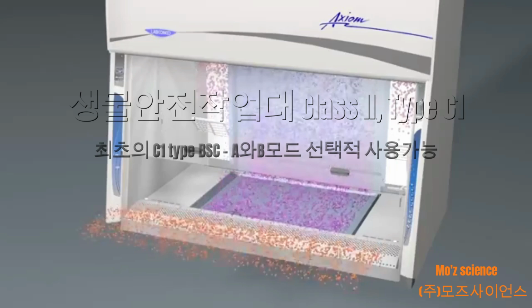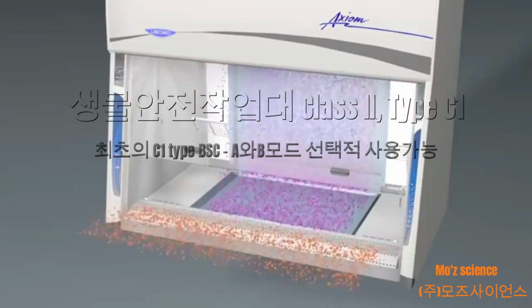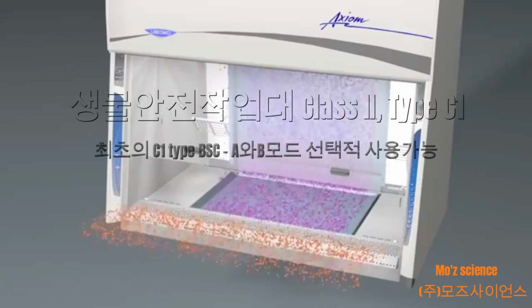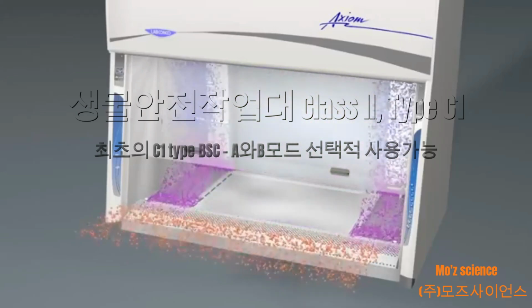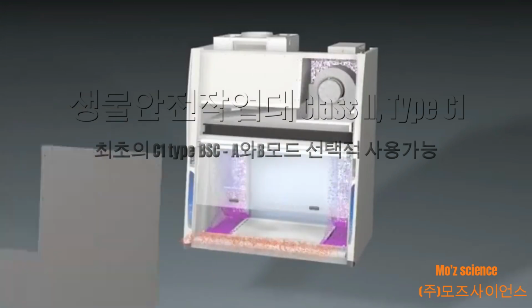Downflow air over the central Chem-Zone work surface is drawn directly into the negative pressure dedicated exhaust airflow system. The recirculated air is drawn up the back of the cabinet and is controlled by the supply blower.